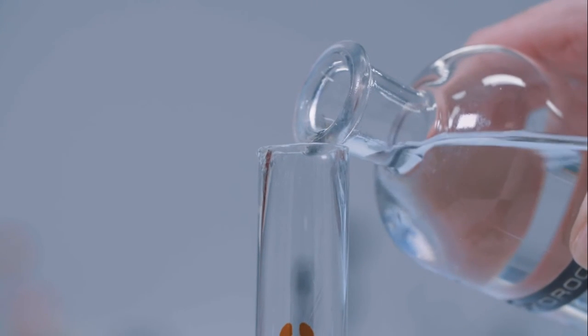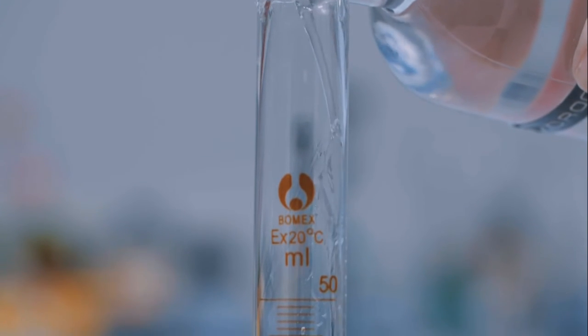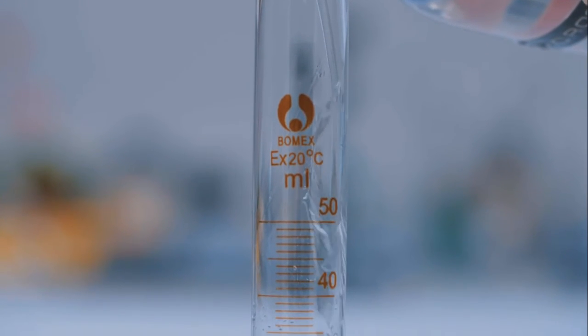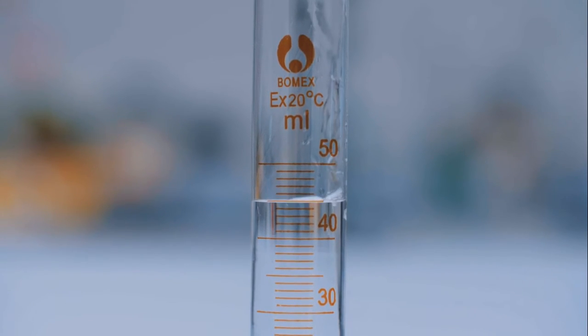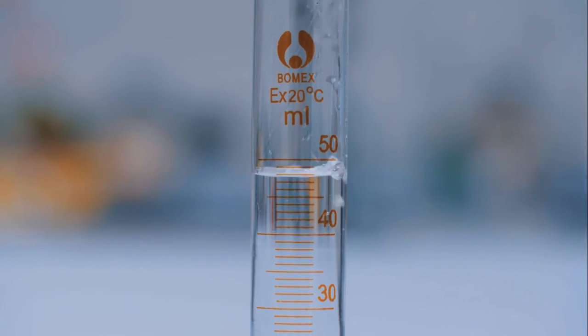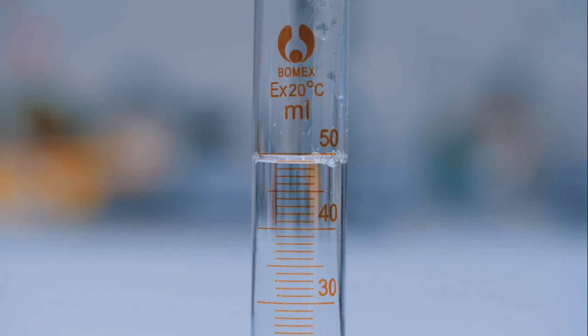Using a measuring cylinder, measure out 50 cm³ of the 2.0 mol/dm³ hydrochloric acid. To ensure you add exactly 50 cm³ of acid, use a plastic pipette to fill to the 50 cm³ mark. Do this at eye level to avoid parallax errors.